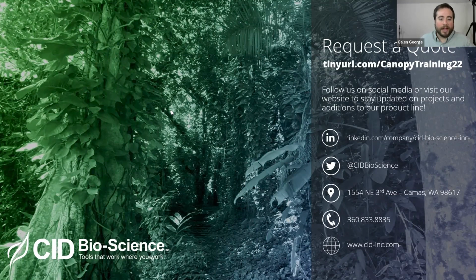Next question is, how is the fisheye distortion corrected in the image analysis? Is a different ratio used for each zenith angle? That is a great question for an engineer. So I would very much recommend that you send that as an email through our support page, and we can actually have our engineers that design the instrument, that are optics experts, help answer that question for you.